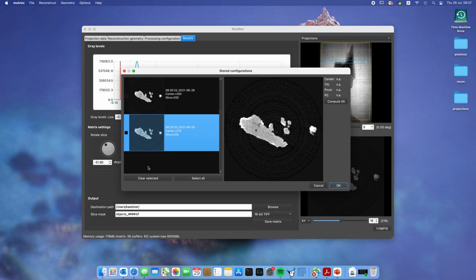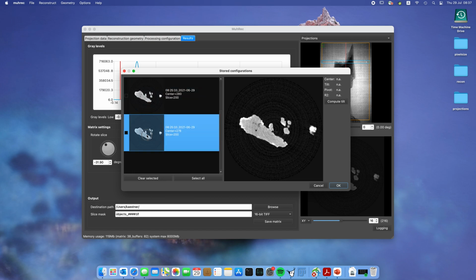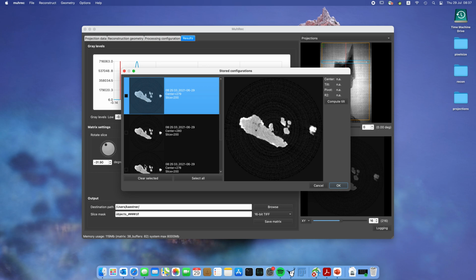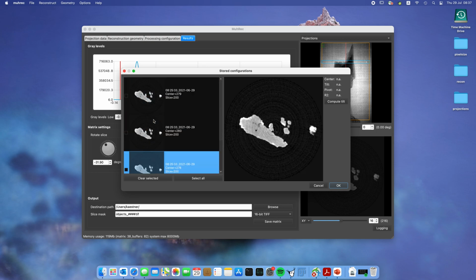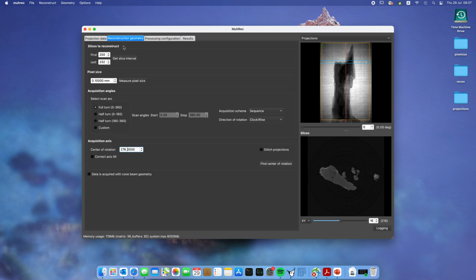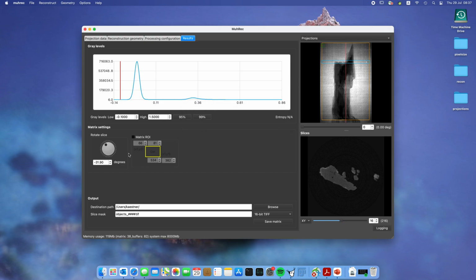And we can look at 78 and compare it to the other. The visual difference is not very big in this case. So maybe we should settle with one of those, or maybe even take the middle of them. So let's take 278.5 as our final center estimate. And then we have something that we are happy with.